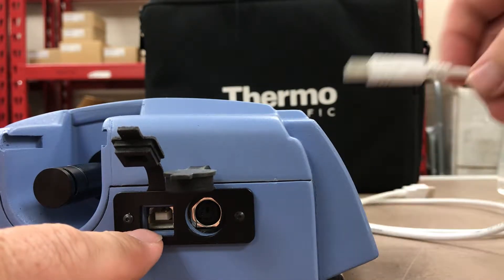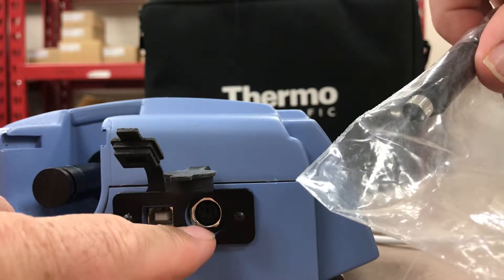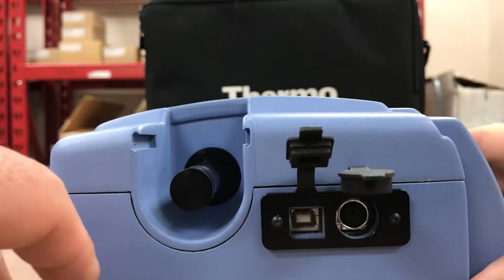And there's another communications port here, and they give you another multi-pin cable right there to fit that jack. Looking over to the side, there is the sample input.